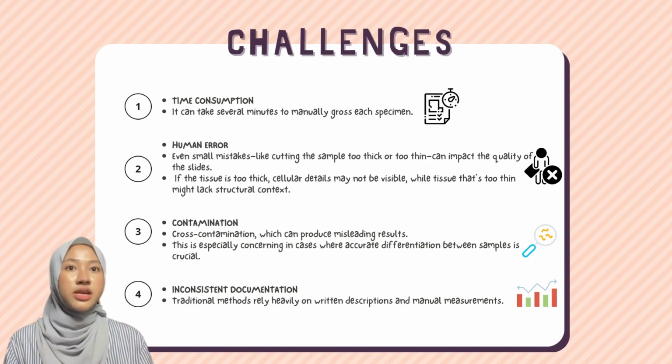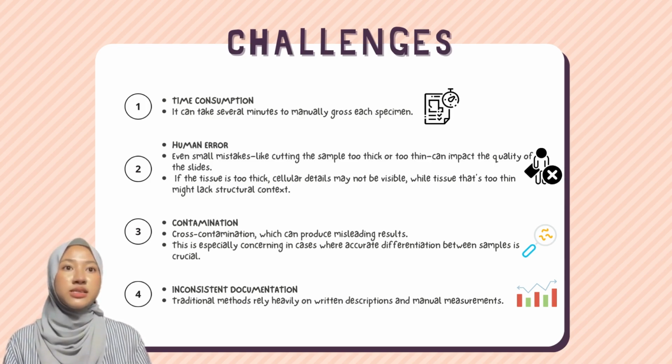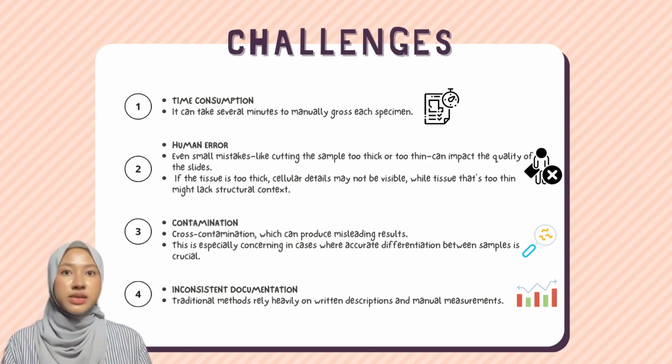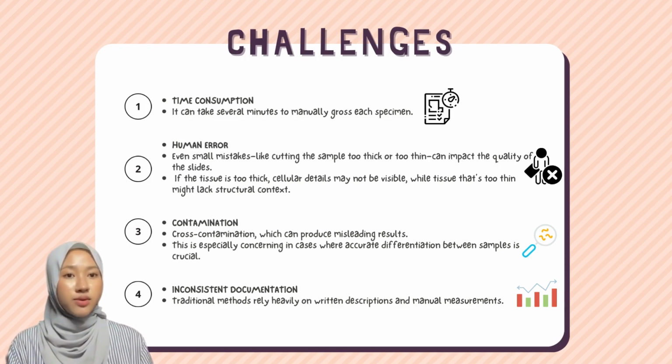Another challenge is inconsistent documentation of grossed specimens. This is because traditional methods depend on written descriptions and manual measurements, which can differ between people and often lack detailed visuals. Written descriptions lack the capacity to fully capture a specimen's visual characteristics, such as texture, color variations, or subtle patterns. This inconsistency can lead to difficulties in case review, comparisons, and accurate diagnosis.